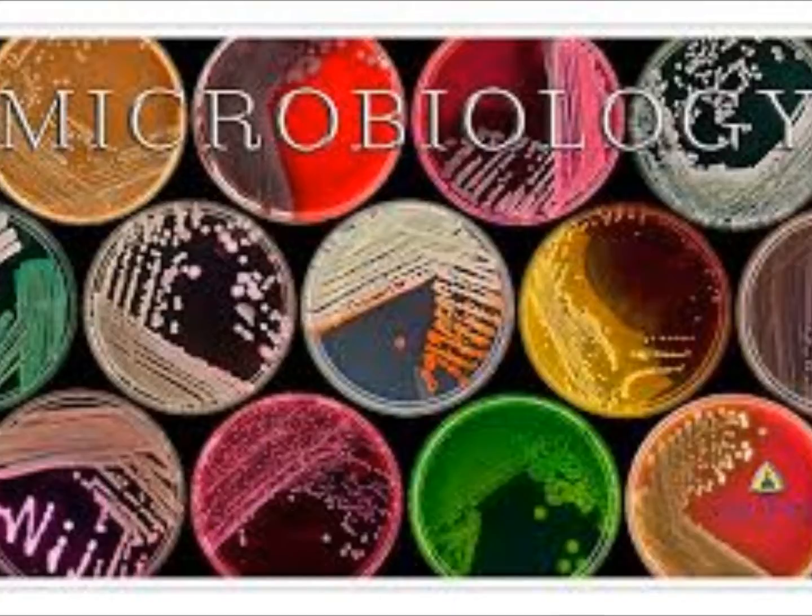You're always doing your colonial morphology evaluation from your blood plate, unless it doesn't grow on blood. Like with the fastidious organisms we talked about, that enriched media won't grow on the blood, so you'll just put NG, and then you have to look at the colonial morphology off the chocolate. But you will not assess hemolysis on a chocolate plate, never.